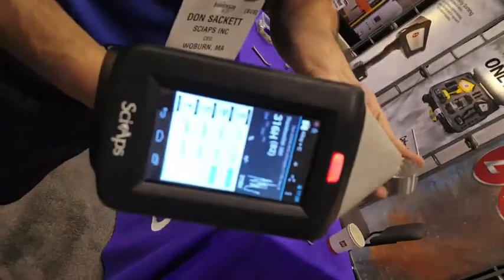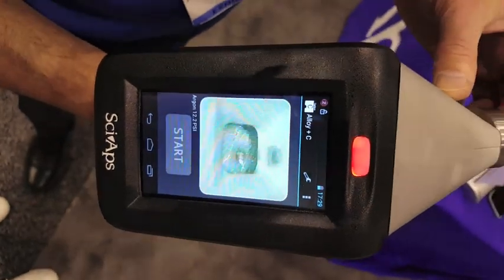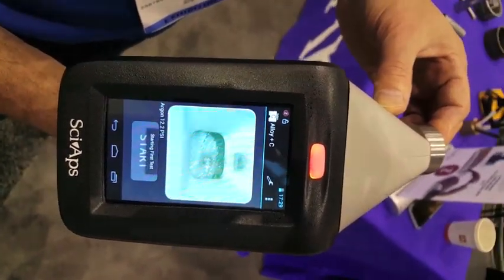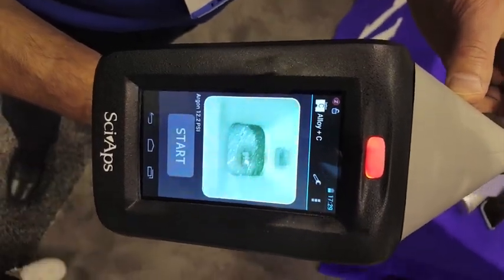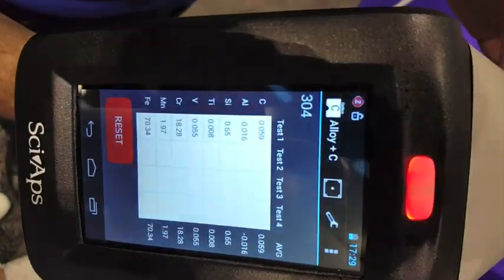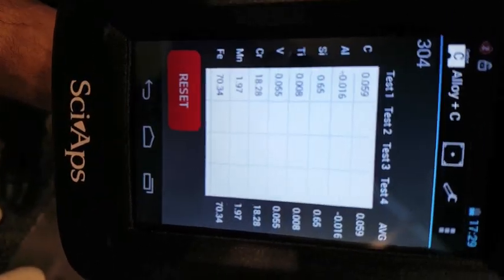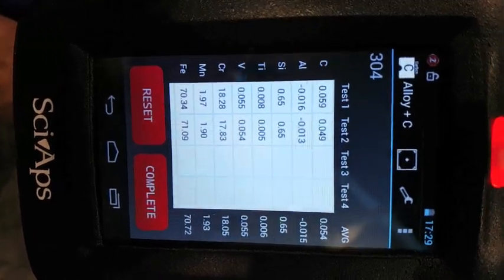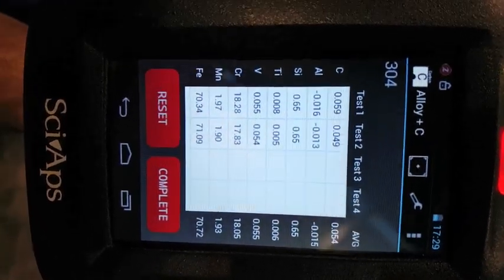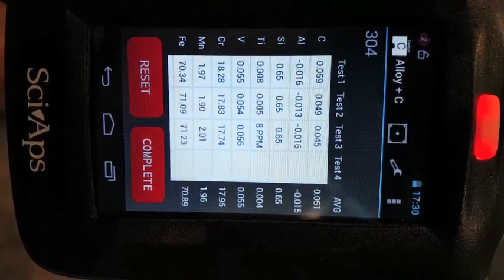Now let's do a 304 here — let's see what the 304 does. Here we go with the pre-burn. Get us our first test here. 059, nice result. 049 — that first test is often still a little high from the carbon on the surface. There we go: 049, 045 — really nice repeatability there.